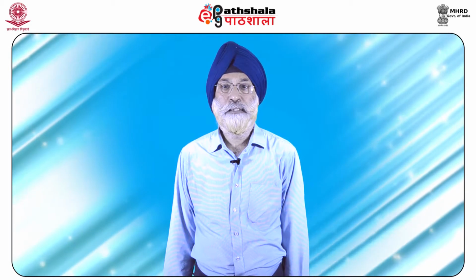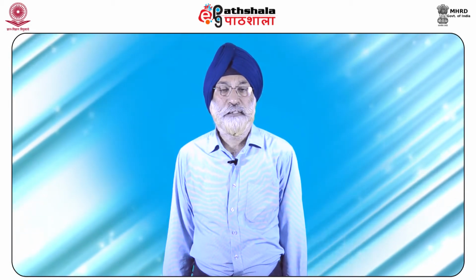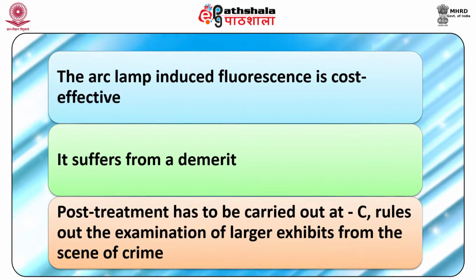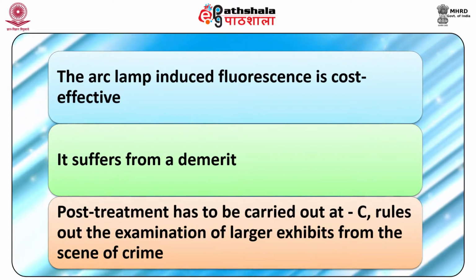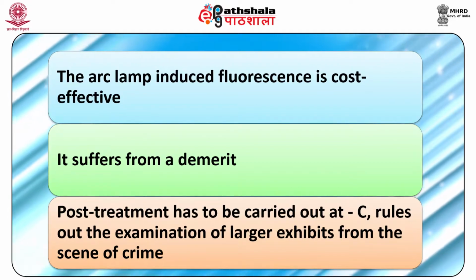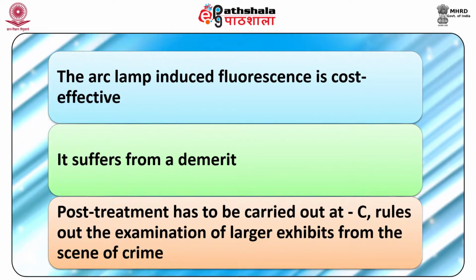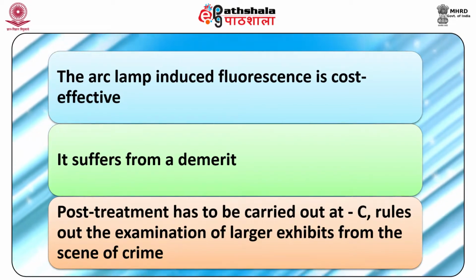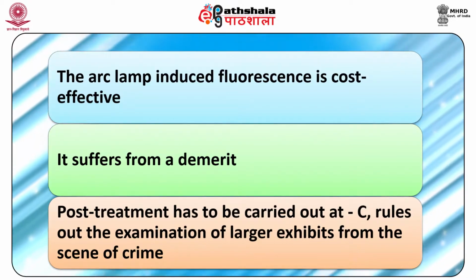Post-treatment with metal salts in concert with lasers. The arc lamp induced fluorescence is no doubt a cost-effective method for developing latent fingerprints, but it suffers from a few demerits. The fact that post-treatment has to be carried out at -200 degrees centigrade rules out the examination of larger exhibits removed from the scene of crime.